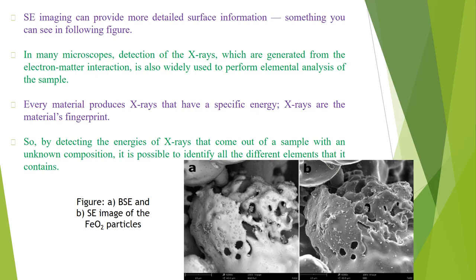In many microscopes, detection of the X-rays generated from the electron-matter interaction is also widely used to perform elemental analysis of the sample. Every material produces X-rays that have a specific energy.